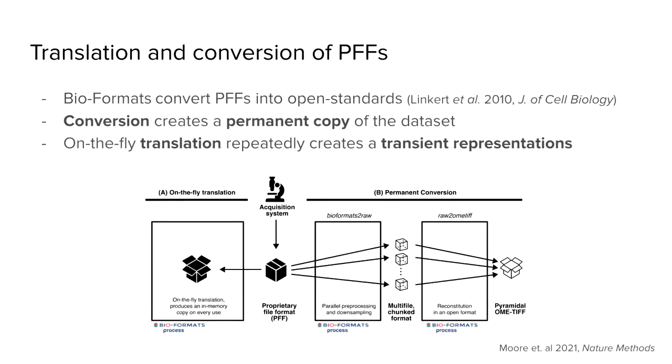So the current mechanism of providing this interoperable layer when we first were evaluating these tools, or the status quo, is found in the form of translation and conversion of these proprietary file formats. What that means is there's a particular tool that's very important in the field called Bio-Formats, which is responsible for this translation and conversion of these proprietary file formats into open standard formats.